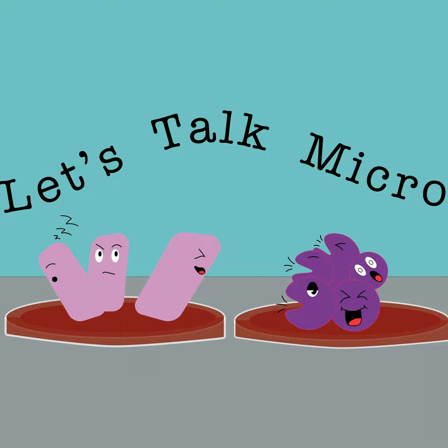And it also increased the inclusivity of it, because family members, friends, little brothers and sisters wouldn't necessarily be able to look through the microscope if they were in the lab in person, but at home they could do that. I think it afforded them an opportunity that they might not have been able to have in any other way. It also, when you're showing somebody else what you're looking at, you have to teach them what you're looking at, and you have to focus for them, and you have to show them how to do this. So I think it also gave them ownership in a different way.